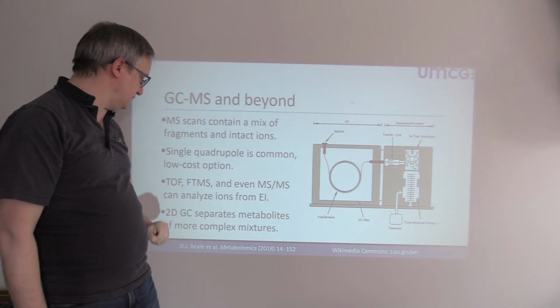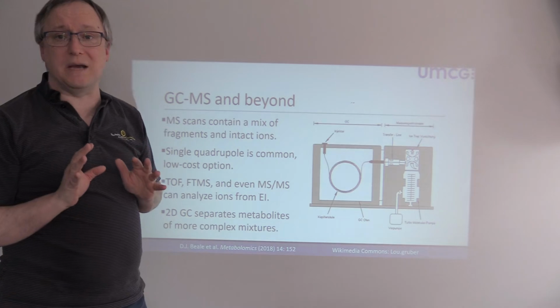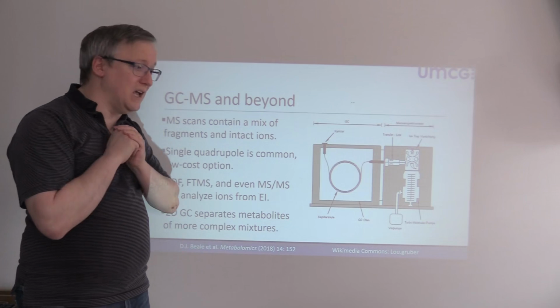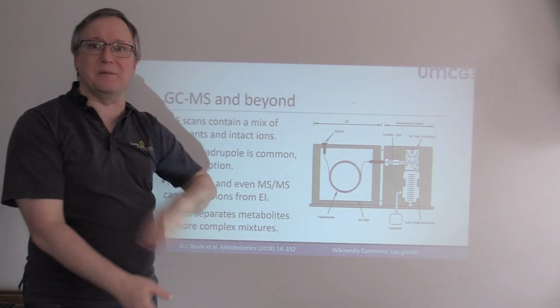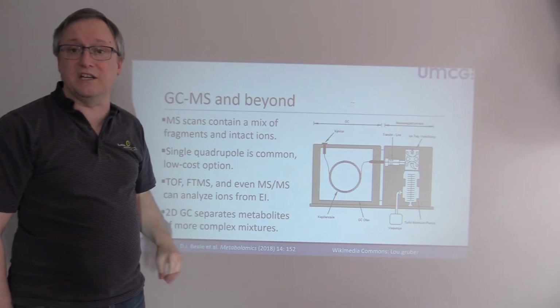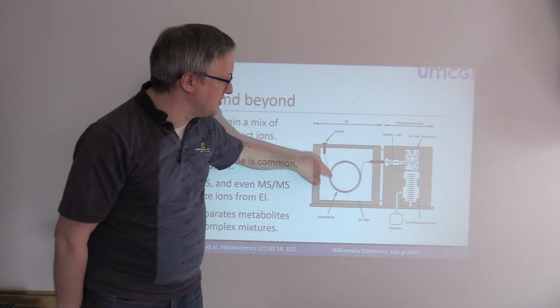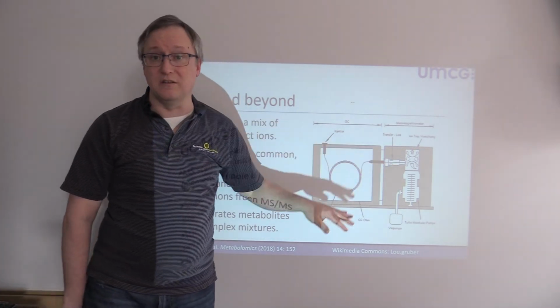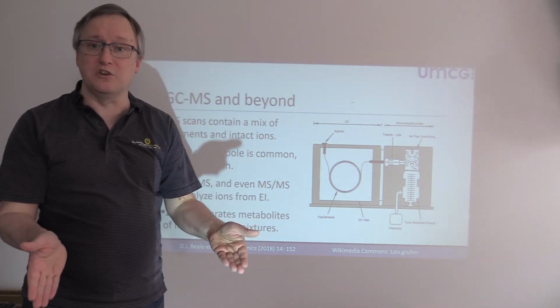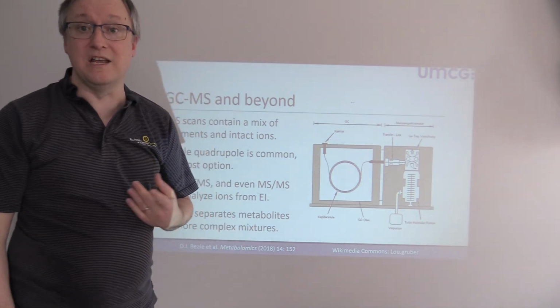this metabolite. Okay, and certainly, just as in proteomics, we sometimes see in metabolomics that we have too complex a mixture for us to deal with in just a single GCMS-MS experiment, or GCMS experiment. So in cases like that, you might end up using a 2D separation. So have a separation to different fractions before you ever got to GCMS. That is also feasible here. It increases the amount of instrument time you spend on each sample, but you should be able to see deeper into the set of metabolites that it contains.